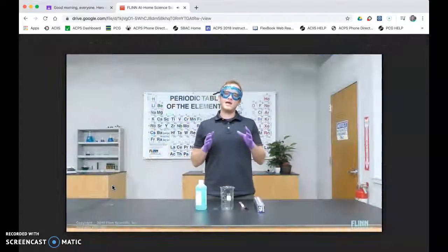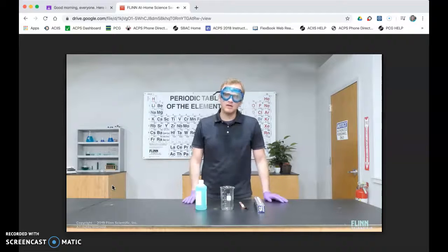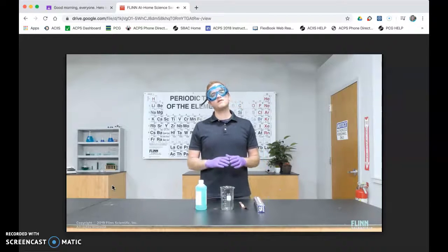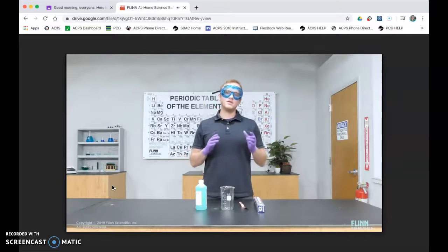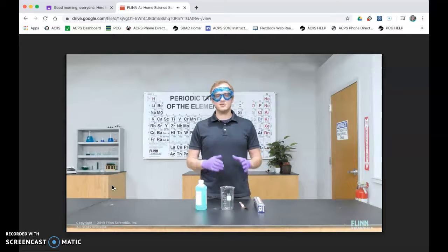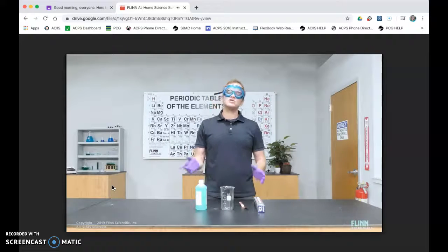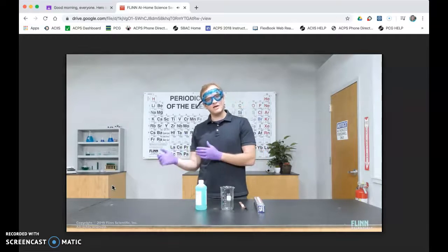Your challenge in this lab is to determine the best metal for a commercial application. And in this case, the commercial application is construction of a fleet of school buses. Now, the driving criterion for this is choosing a metal that resists corrosion. And corrosion is really the reaction of the metal with oxygen to form the metal oxide.